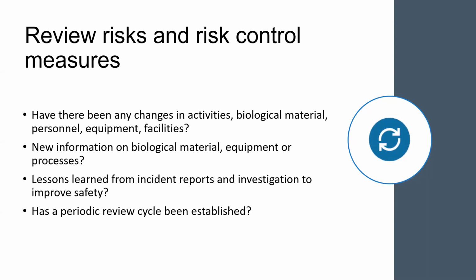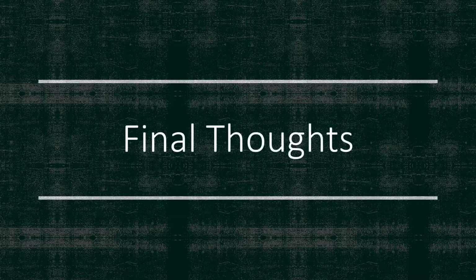You need to evaluate, particularly if there are incidents, because what that tells you is that your risk controls are not working. Either it could be training for your staff, which is more than likely. Usually that's how incidents occur, from staff members being careless or ill-trained or something like that. I mean, it's true. So that tells you that you need to review at that point.